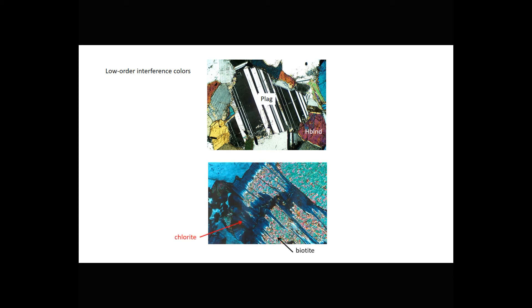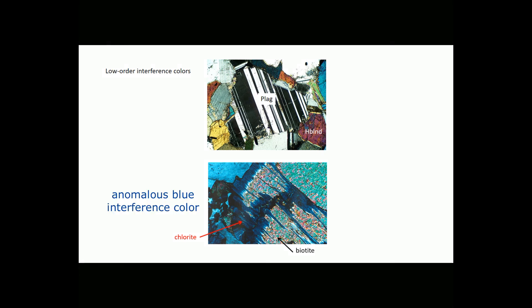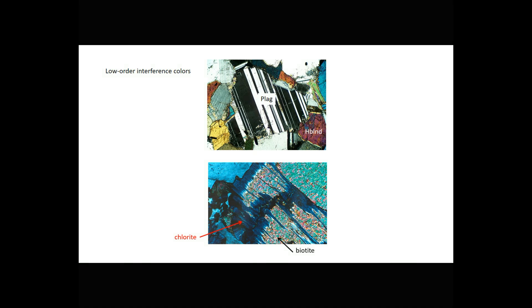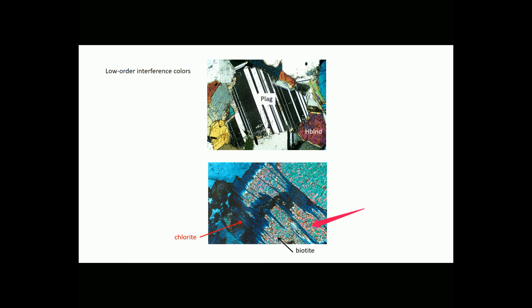Some minerals — and chlorite is a great example — display what we call anomalous interference colors. We call them anomalous because they don't show up on the normal interference color chart. Anomalous interference colors are caused by two things most of the time: either the mineral has very low birefringence, which can give very strange interference colors, or the mineral is naturally colored and the strong natural color of the mineral masks the interference colors. In the bottom view, there's biotite with a middle- to upper-order interference color pattern, which is altering to an inky blue chlorite — the biotite was turning into a low-temperature mineral but the reaction never went to completion.